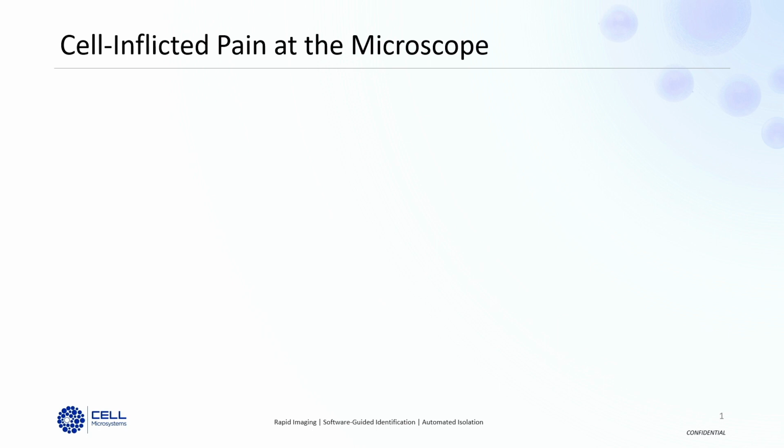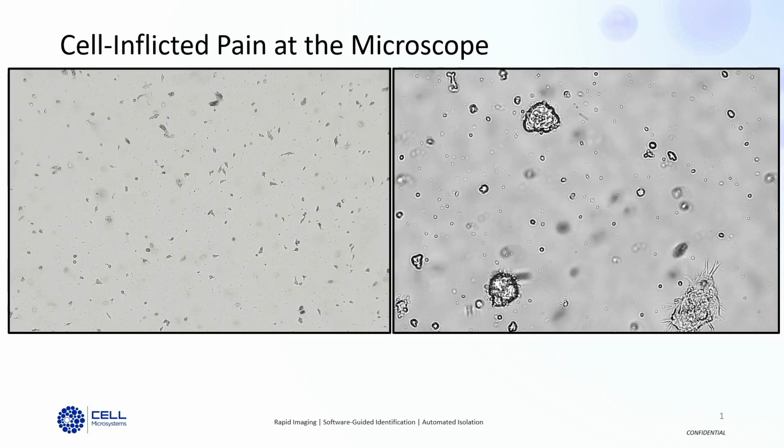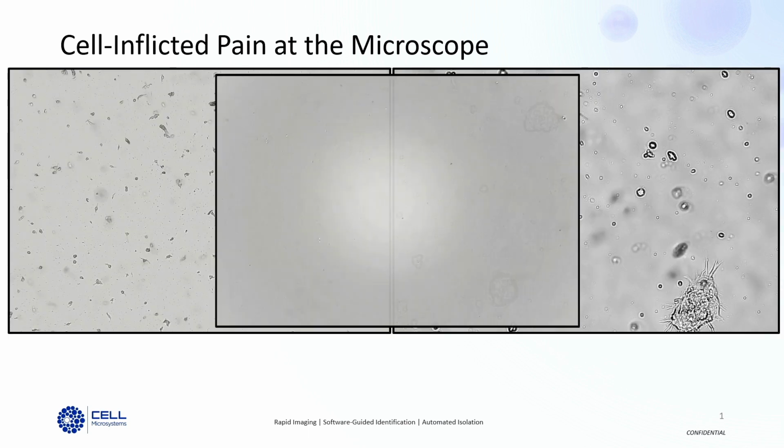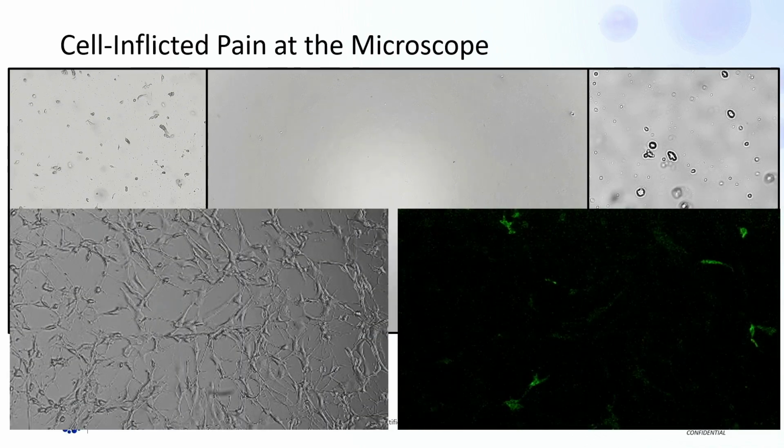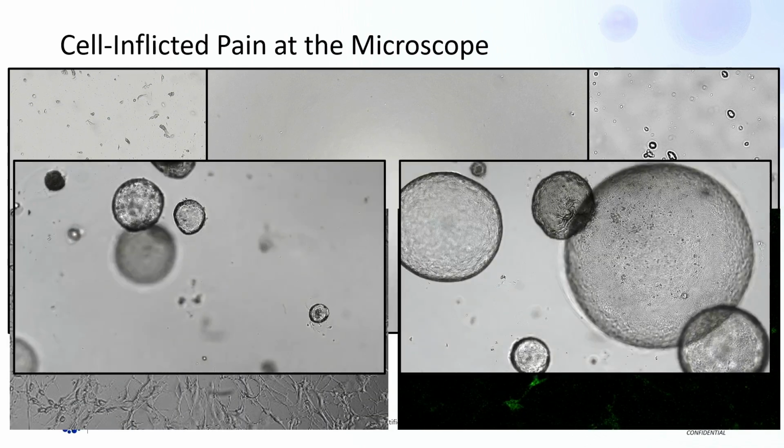I'm imagining that many of you here are scientists at the bench, or you're managing scientific programs. So we all know what it's like to walk into the lab, put your cell culture plate on the microscope, and then have that gut-wrenching feeling. Why? Because of dead cells, empty wells, polyclonal populations, and if you're ambitious enough to take on organoid assays, well-to-well variability that is sure to impact your downstream assessment.